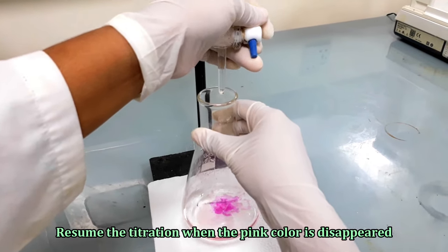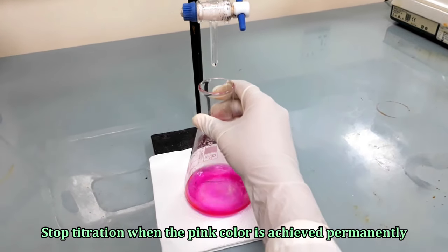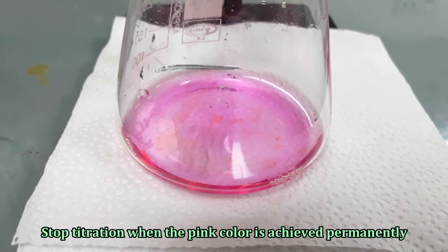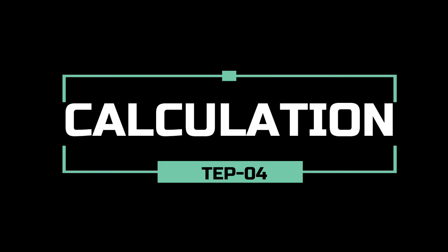Pink color indicates the end point of the titration. Note the final burette reading. It's time for the calculation.